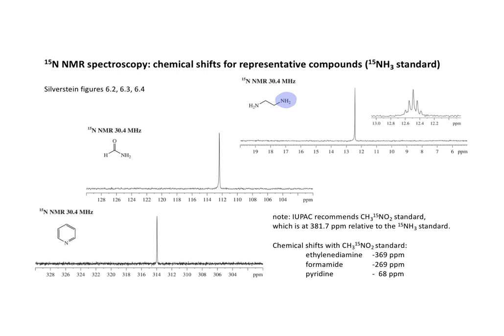Note that in the proton-coupled spectrum there is an apparent pentet, and that is consistent with 2 hydrogens attached to the nitrogen and 2 hydrogens on the adjacent carbon atom, all of which happen to have a similar nitrogen-hydrogen coupling constant.